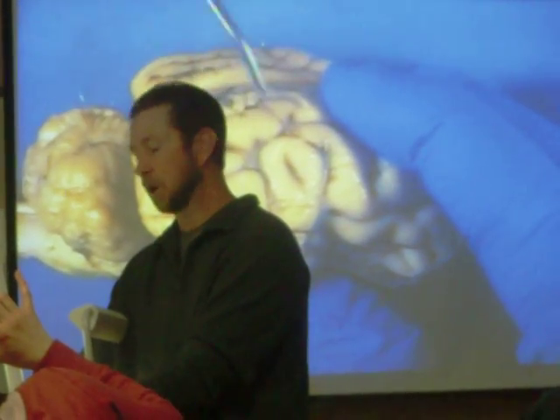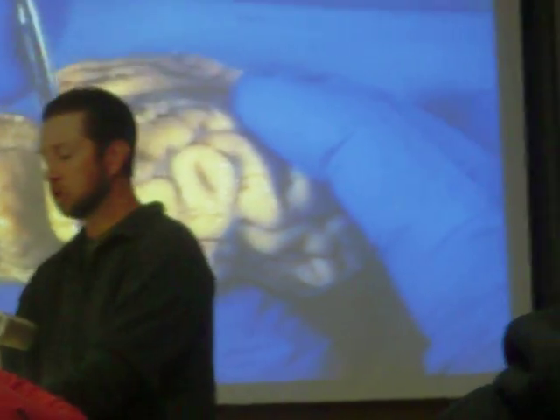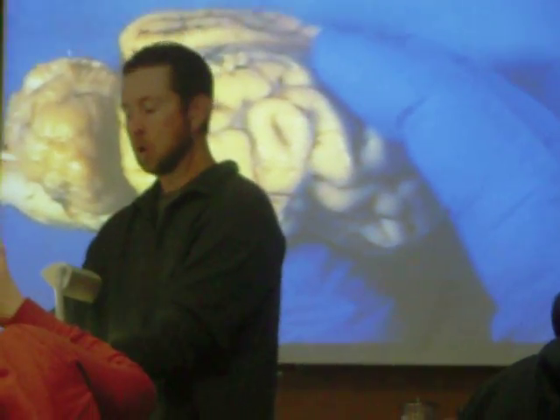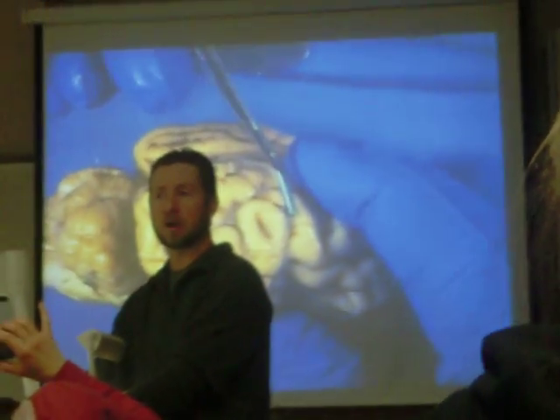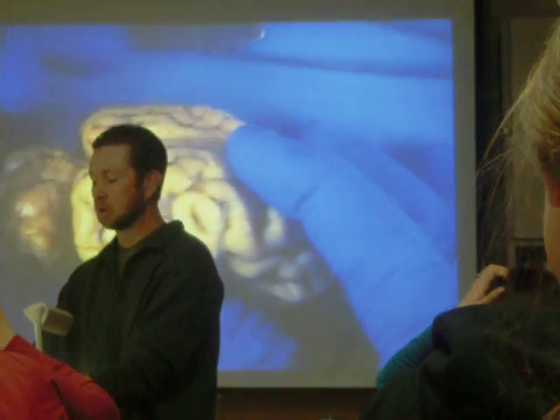And like I said, on the sheep brain, it doesn't stand out as much as it does on the human brain. On the human brain, you'll see a distinctive temporal lobe and then a distinctive fissure that goes right into that lobe. When you pull apart that fissure and look deep underneath the temporal and below, or inferior, to the parietal lobe, you will see this separated lobe inside called the insula.